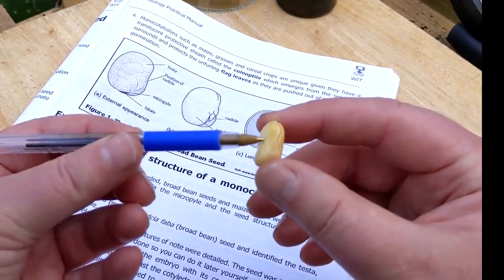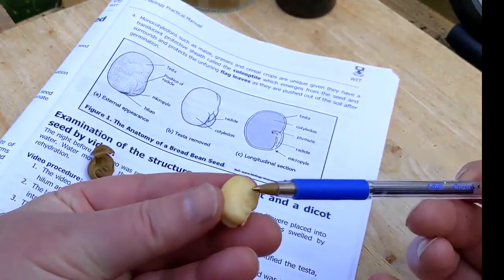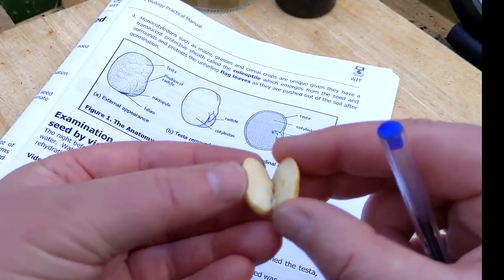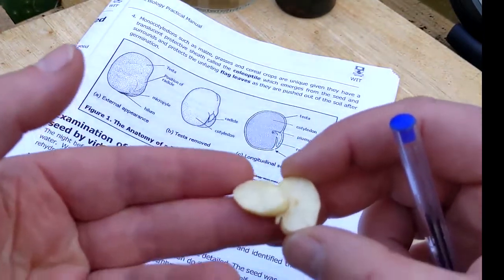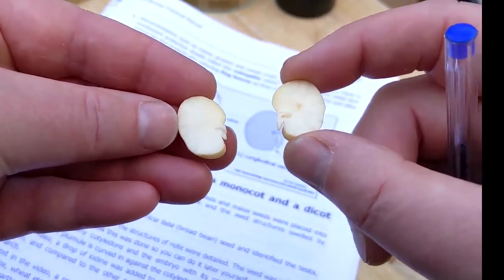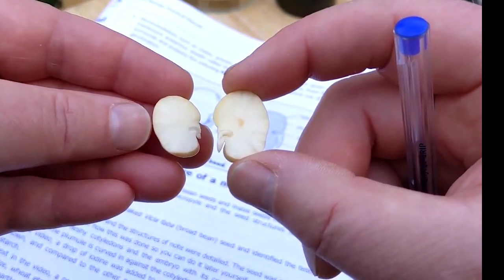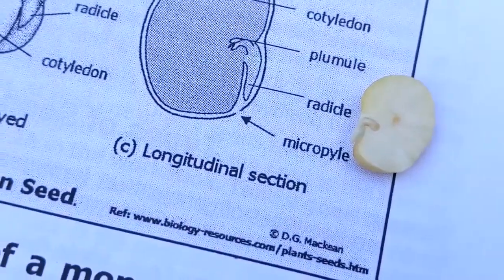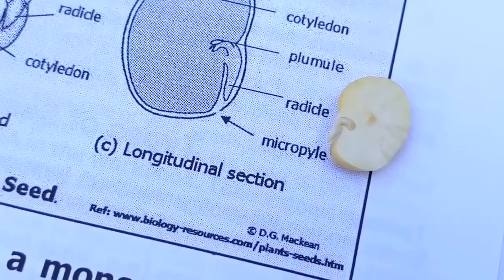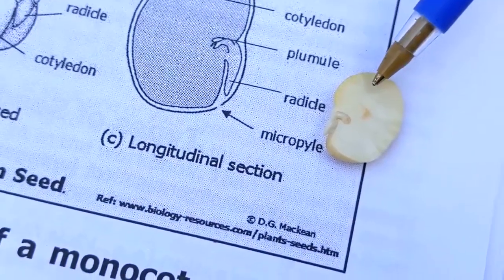This is one cotyledon — remember this is a dicot seed — and the other side is the second cotyledon. We can very gently pull them apart to see the internal anatomy of the seed. Here we have one half of our seed; we've removed the testa and identified the cotyledon.